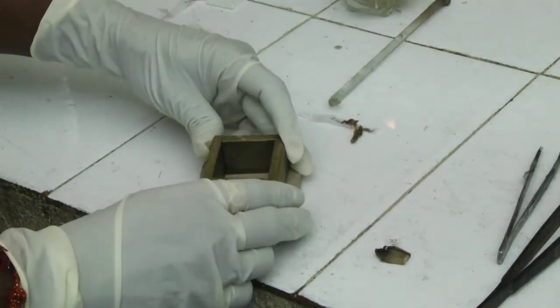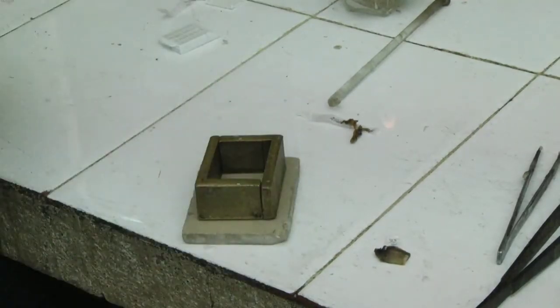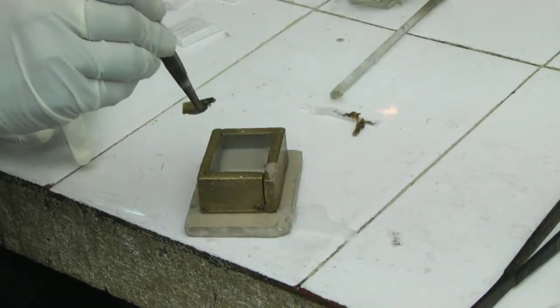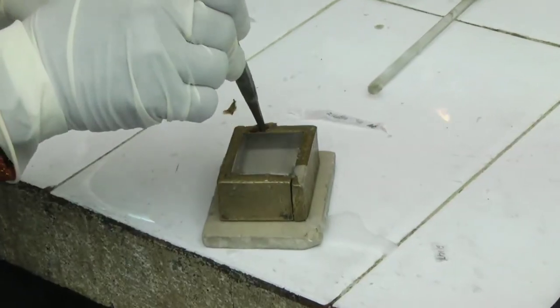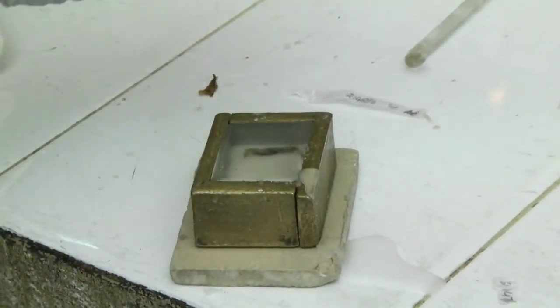At first, lubrication of the metallic molds is done with liquid paraffin. After that, melted paraffin is poured in and the tissue is carefully embedded in the proper plane at the bottom of the metallic molds. It is important for the technician to have a sound knowledge of basic histology and tissue orientation to be able to embed in the correct plane so that all layers of tissues can be visible on the slide.